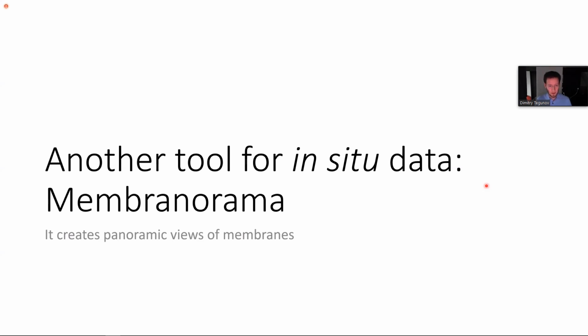So this is a piece of software that I wrote for visualizing the organization of membranes in situ. Usually, if you acquire an in situ tomogram and you want to look at those membranes, you have a big problem.